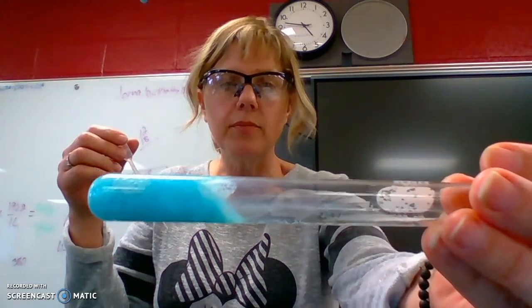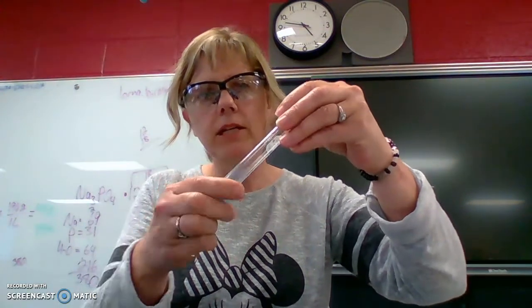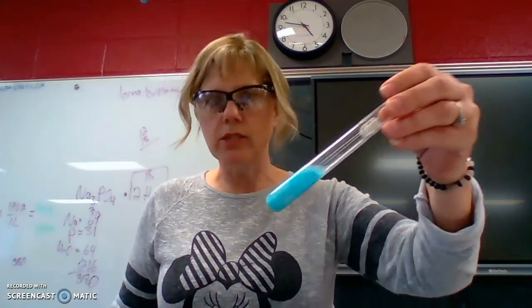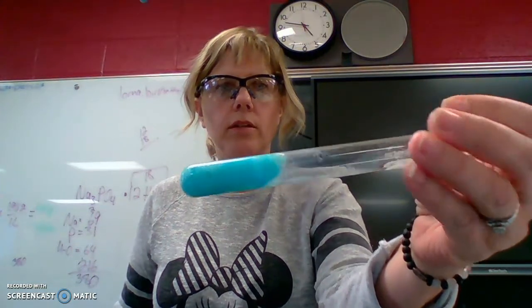So think about the types of reaction we talked about where that might happen. I'm going to feel it. It doesn't seem to be any temperature change that might be important, so let's write that down. But the biggest thing is we get this super cool, real thick gel precipitate. So it's now a solid.